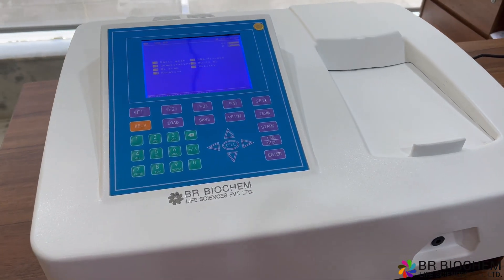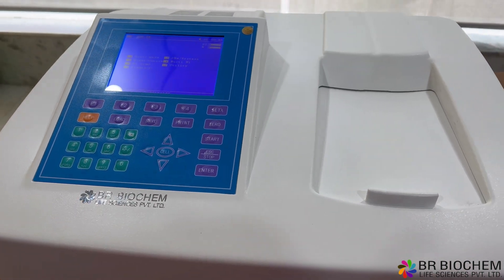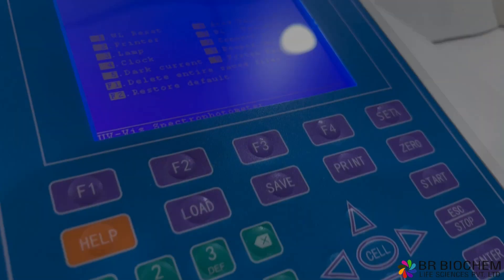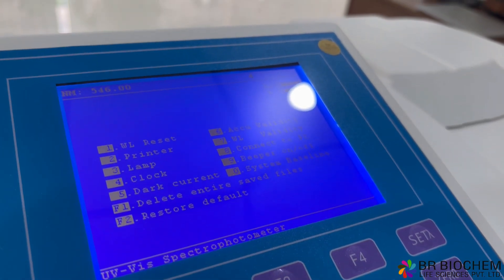Our spectrophotometer boasts several notable features. The double beam optical system ensures low noise and minimal stray light, guaranteeing accurate and reliable results. The large LCD display provides a clear view of data and curves, facilitating easy analysis.